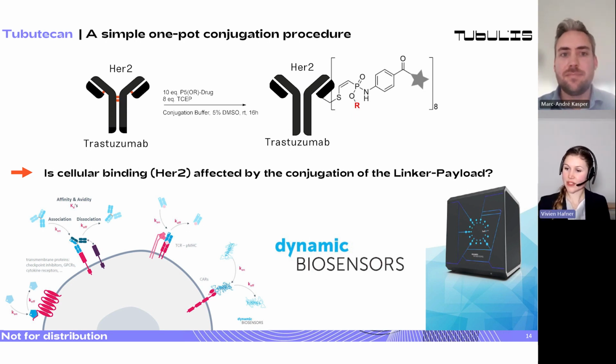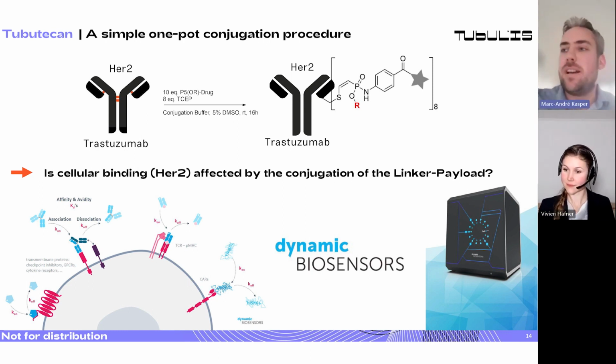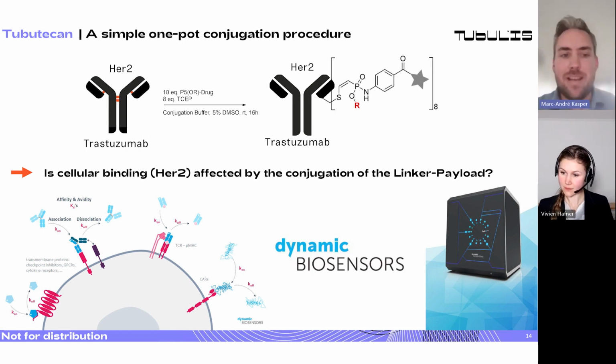Then there's another question about the linkers, whether you have used enzyme-activated linkers in the ADCs, or if you have any suggestions in choosing this type of linkers. Yes, we do. So with enzyme activation, I think you're referring to a cleavable linker, which releases the payload after the ADC is taken up into the cell. And yes, we do. And also we do think it's crucial for a couple of reasons.